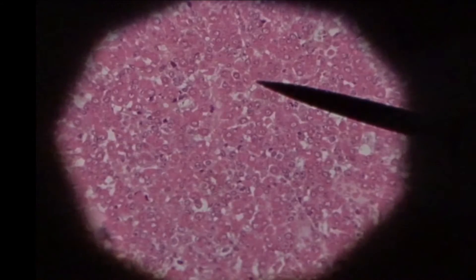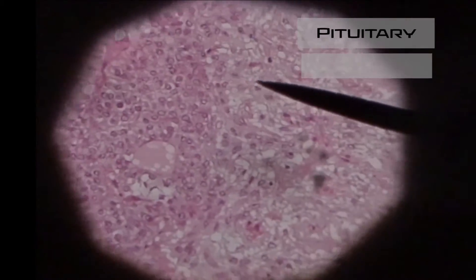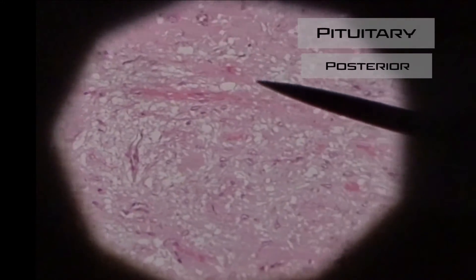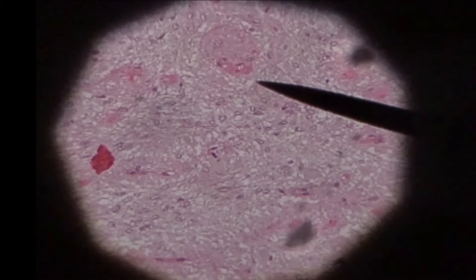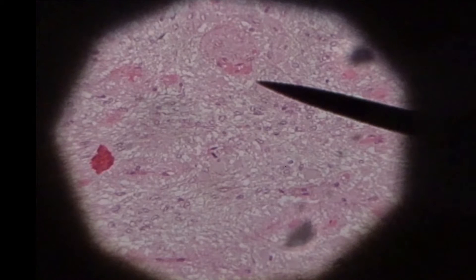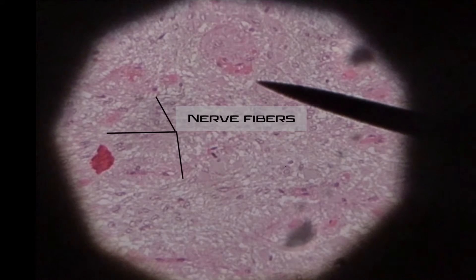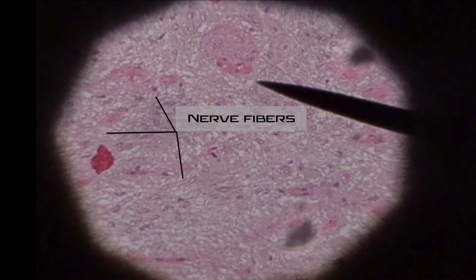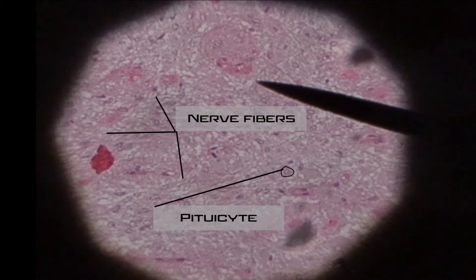Next, we're going to look at the posterior pituitary. This portion has a more direct connection to your hypothalamus. In here you're going to see a lot of the nerve fibers of neurons from your hypothalamus that travel down into this part of the pituitary gland. You should also be able to see the pituicytes, which are the cells that house the hormones that the hypothalamus has made.